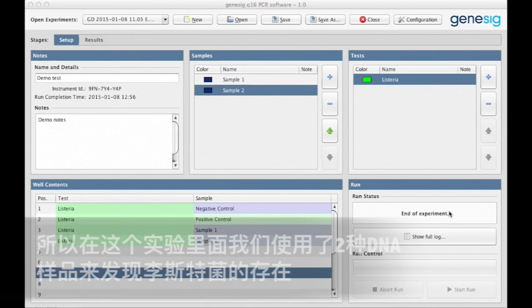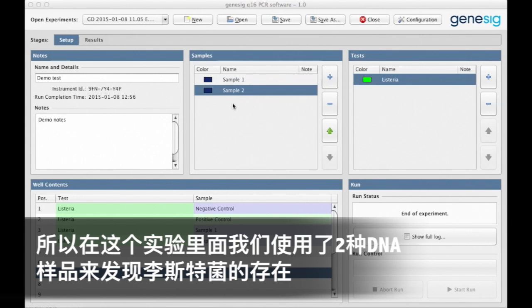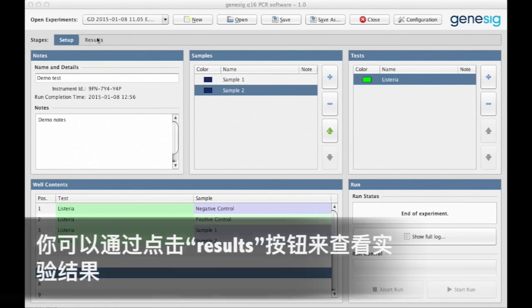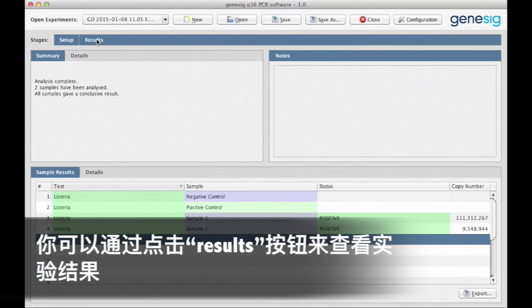So in this example, we've analyzed two DNA samples looking for the presence of Listeria. You access your results by clicking the Results tab up here.